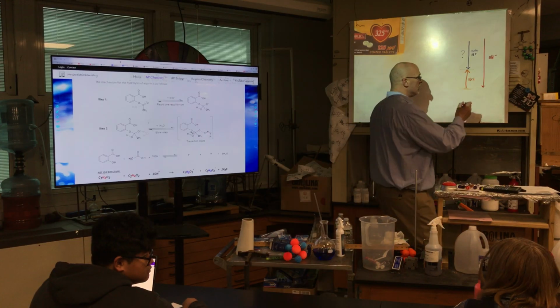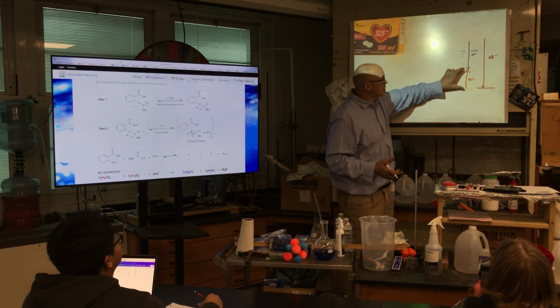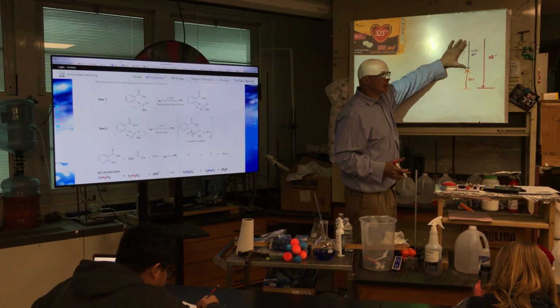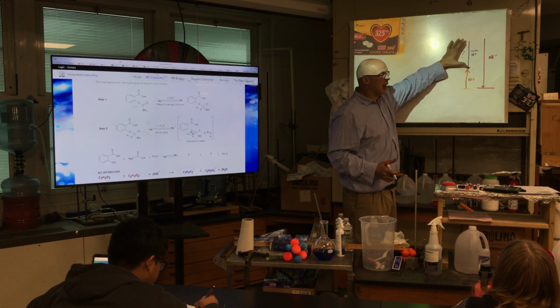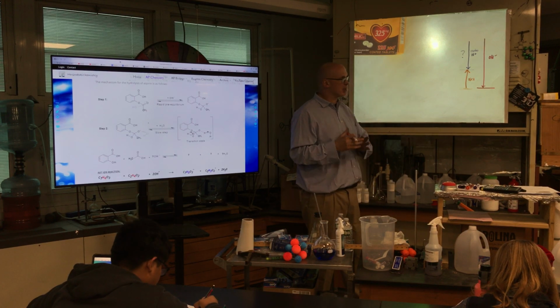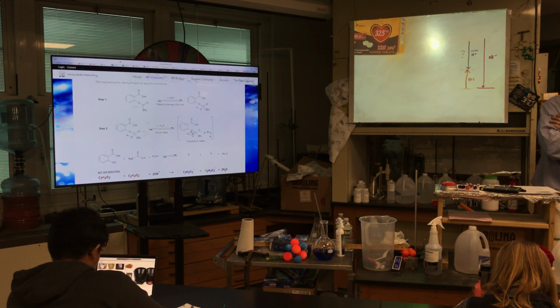We need to know the total moles of hydroxide, correct? When we do this, we subtract, correct? And what we get is this arrow of moles that really represents the aspirin, okay? Now, it seemed to me that there was a misunderstanding in my first period because this is exactly what we did in the Tums lab. Now, here's the problem that we're going to run into today.